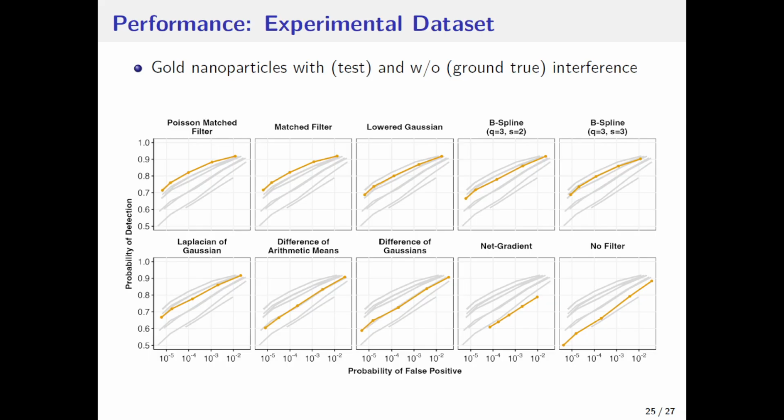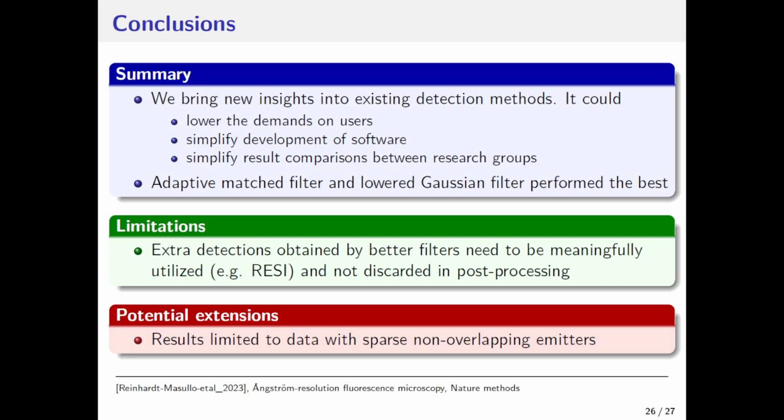So we proposed a trick, also proposed in other papers, where we measure our sample in a perfect single background, high SNR condition, and take this measurement as a ground truth and compare it to the measurement where conditions were much poorer with an additional interference. And this brings me to the conclusion.